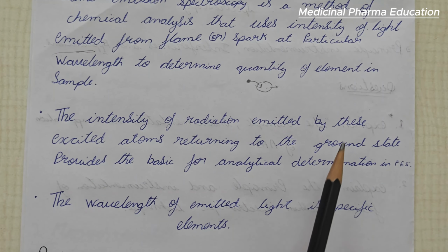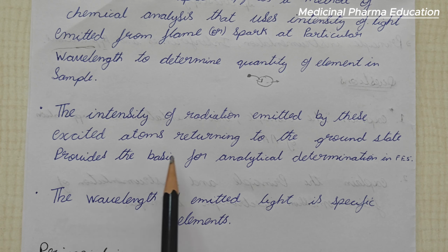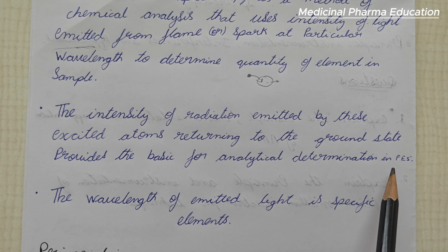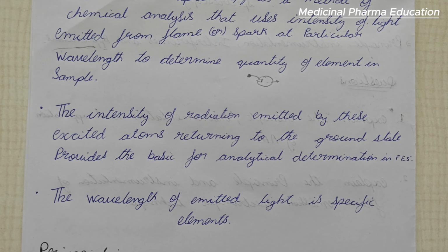Okay, next, the intensity of radiation emitted by these excited atoms returning to the ground state provides the basis for analytical determination in flame emission spectroscopy. I already said, we have already discussed emission spectroscopy in spectrofluorometry. The same topic is here, you should apply.